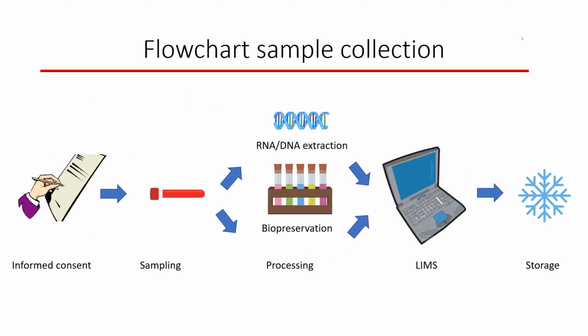This is a flowchart of sample collection, and I will go through all the different steps for you. It starts with informed consent, followed by sampling, processing, adding the samples into a laboratory information management system, and then storage.